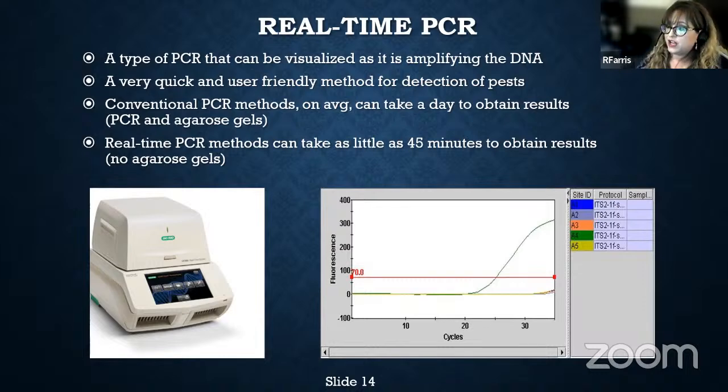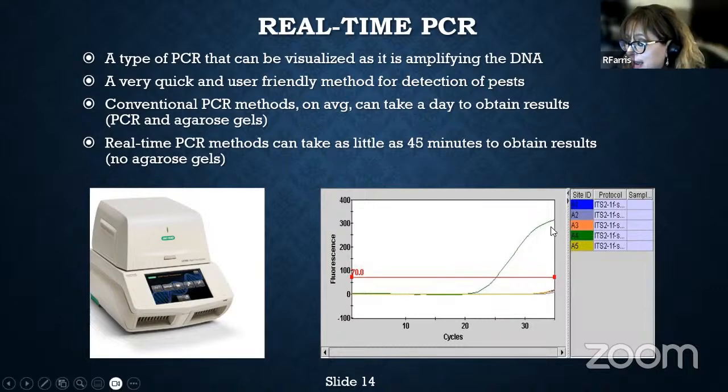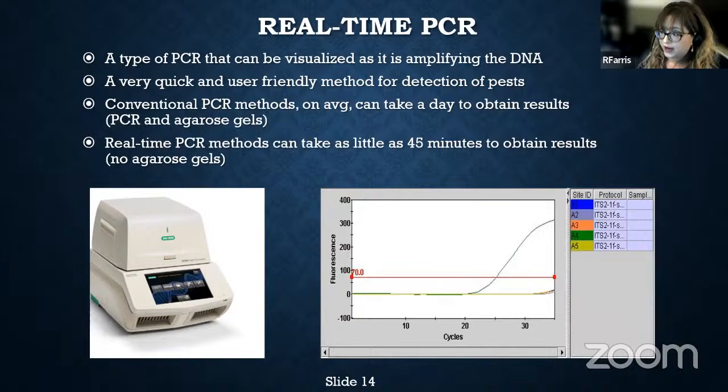But the difference is that the probe has on it a fluorophore that will fluoresce upon DNA amplification. So the advantage of using real-time PCR is that you can visually see when your DNA is being amplified as it's happening. Unlike conventional, where you sit and wait 3 hours and you have no idea what's happening, you have to wait the 3 hours and then load it on a gel to be able to visualize it and see whether or not it worked. With real-time PCR, that eliminates the need to wait as long as the 3 hours, and it eliminates the need of having to perform a gel electrophoresis.